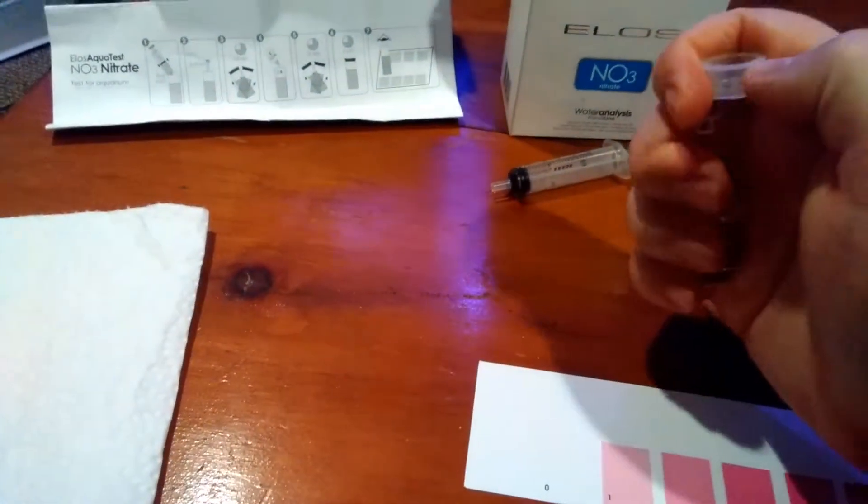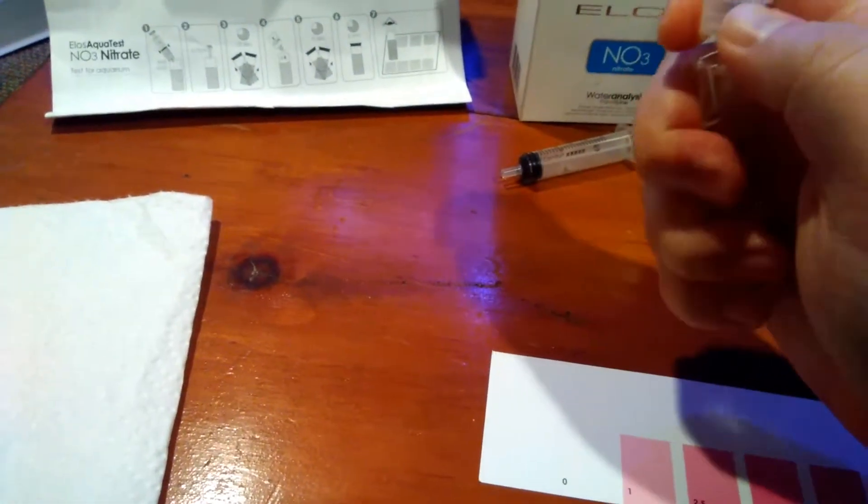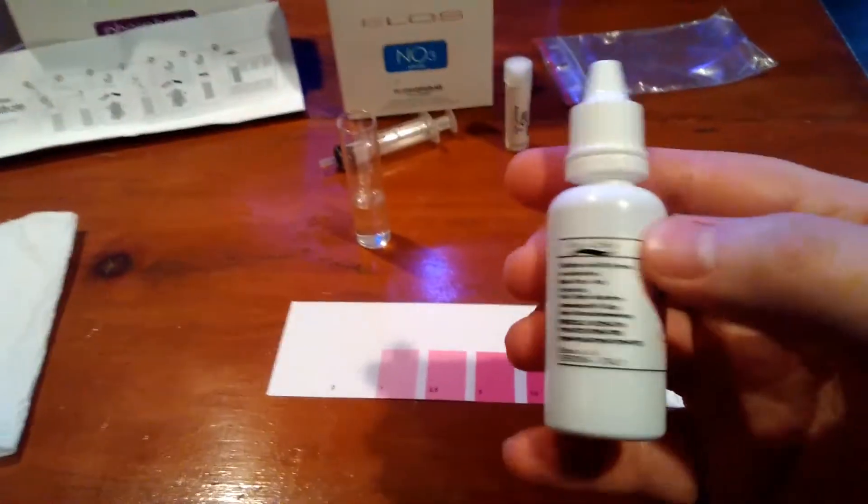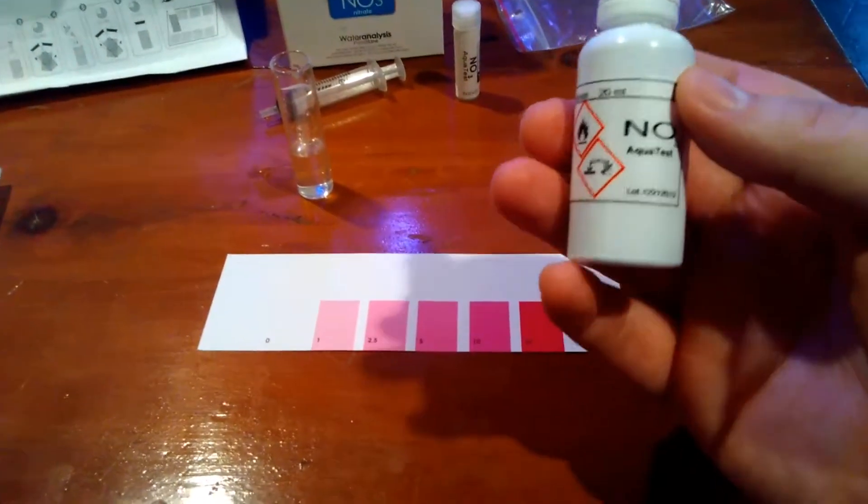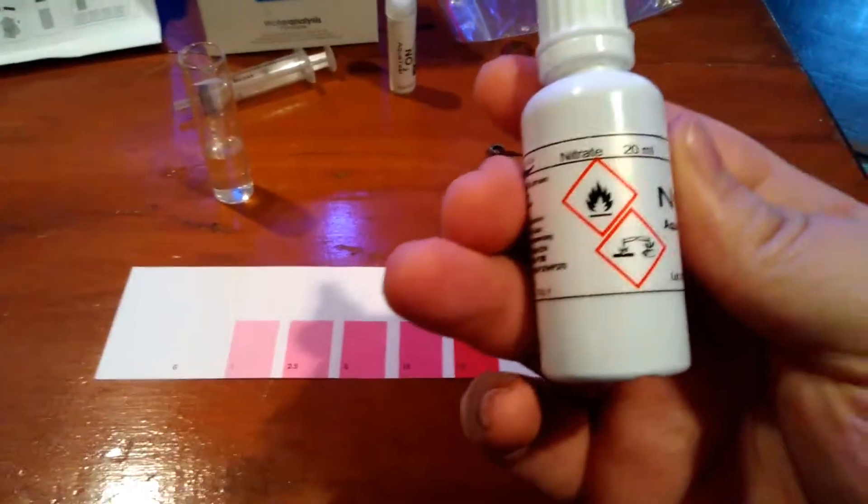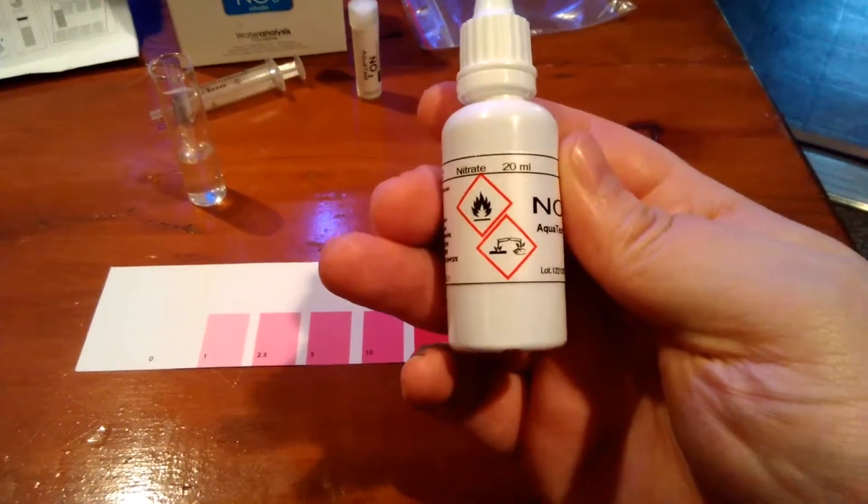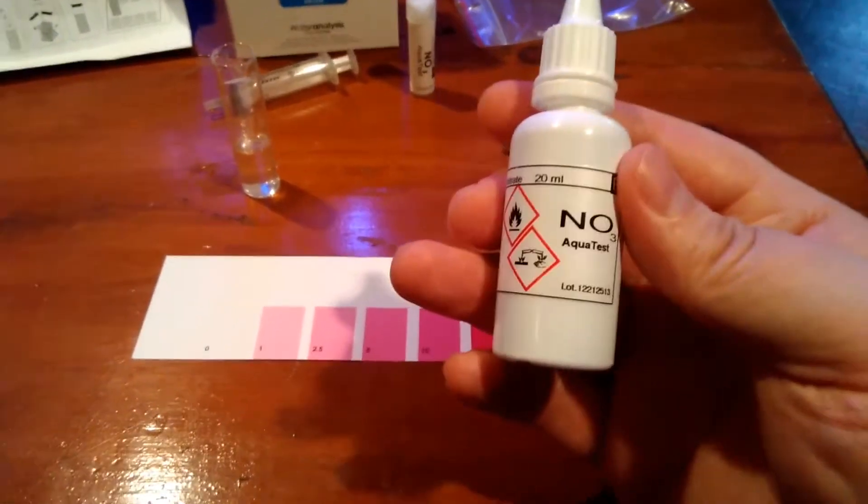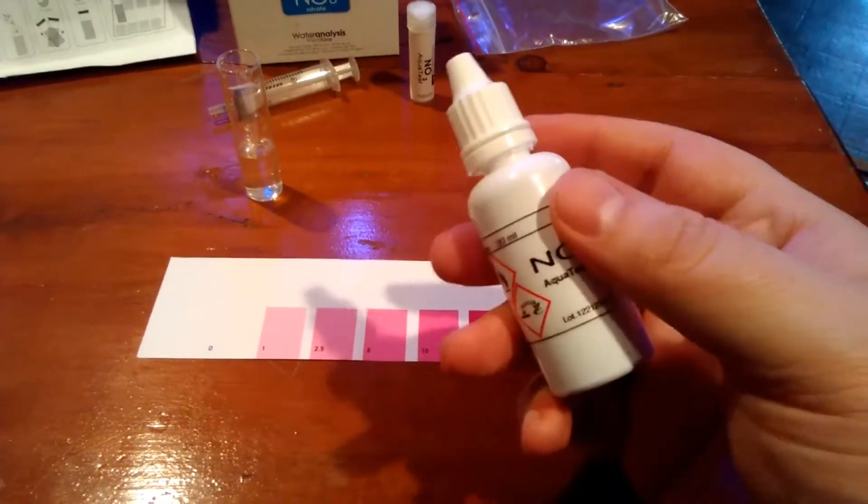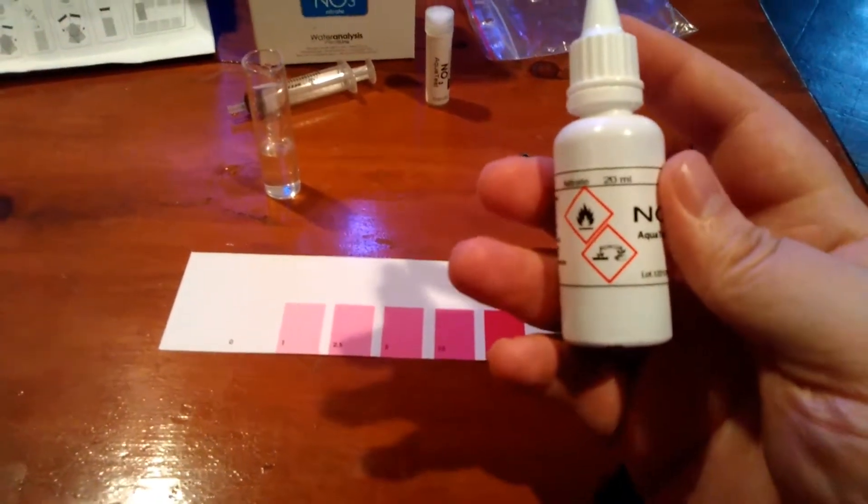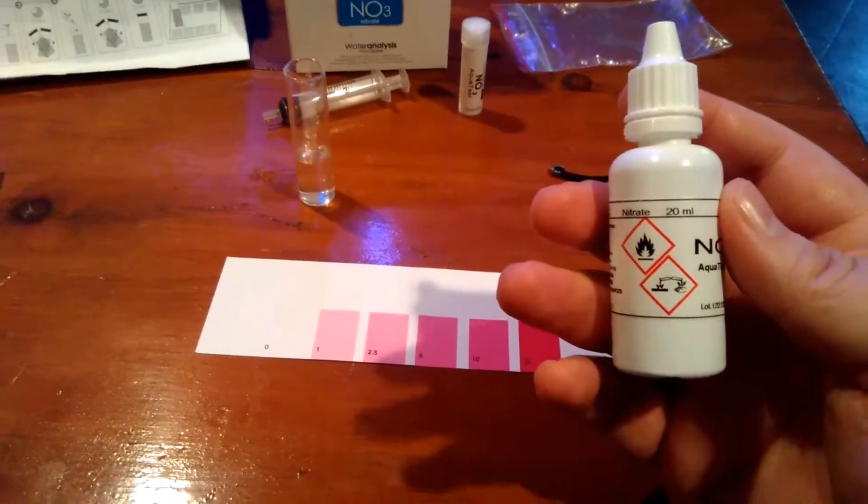Alright, pop the top off on that. This is the liquid reagent. Now if you notice, there is a flammable and an acidic symbol on there. So what they want you to do is once you uncap this and put your 6 drops in, put the cap right back on because this does have a smell that's not really too great. But I'll tell you what, does it really matter?